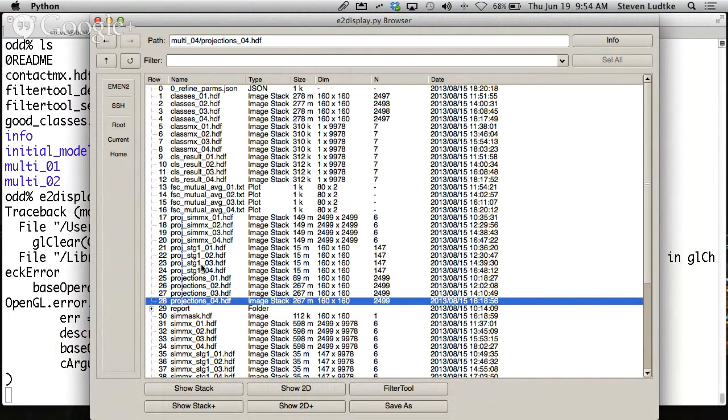Now, when I'm doing this multi-stage classification I talked about before, in the case of a multi-model refinement, I actually get an extra little benefit, because this is definitely a case where two particles in similar orientations are not going to be the most similar to each other. If I have multiple input models which are pretty similar except for some perturbation, then I would expect the same orientation in the three different input structures to look almost exactly the same.